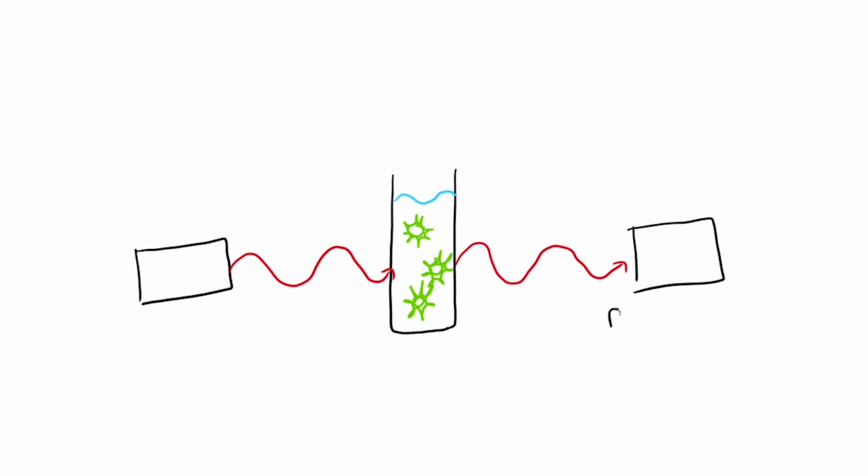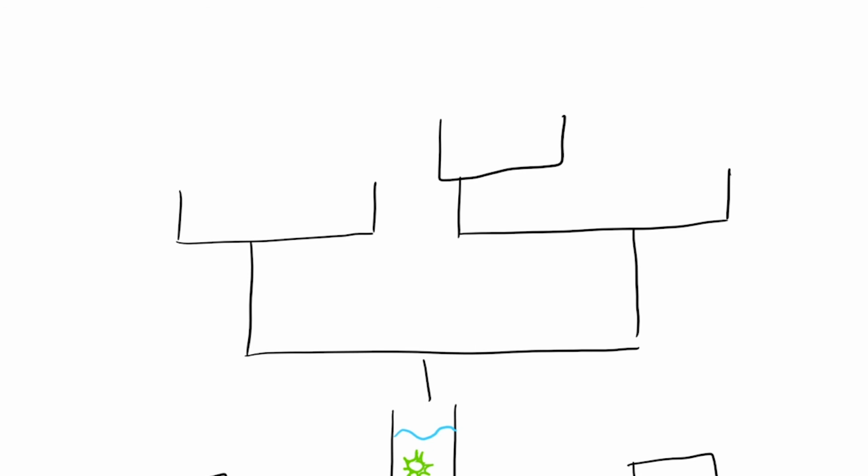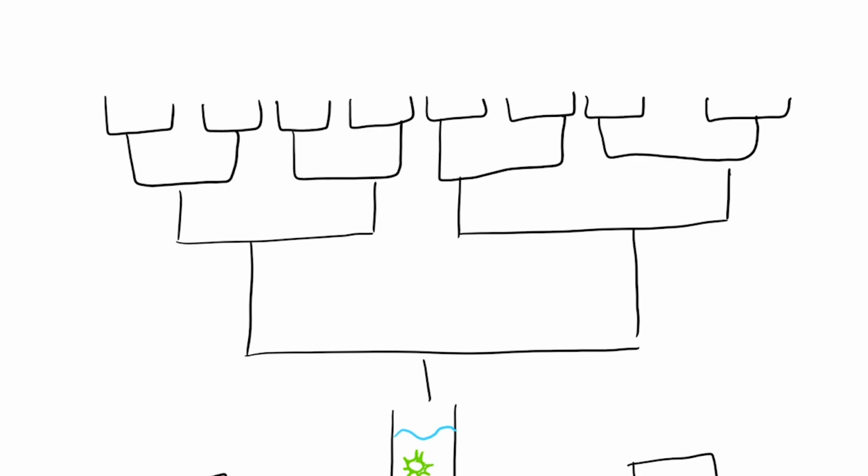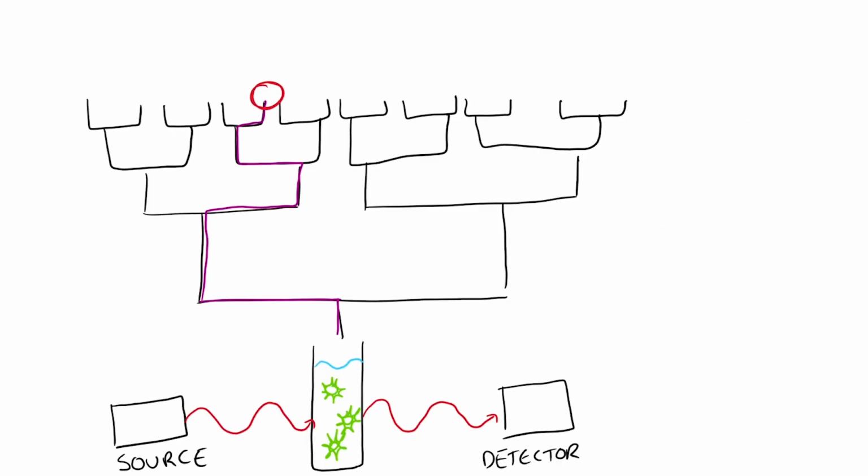More recently, microorganisms have been shown to be able to be detected using FTIR. The unique biochemistry of each microorganism also causes them to have unique fingerprint regions. Because of this, a bacterial sample can be isolated and grown, then suspended in solution and measured. Libraries of organisms have been developed, like those for drug detection, that the sample can then be compared with to find a match. This can also be used to produce dendrograms of similar strains.